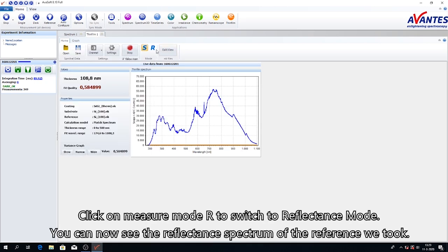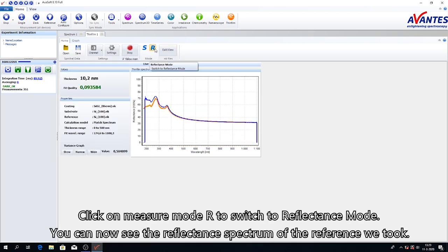Click on Measure Mode R to switch to reflectance mode. You can now see the reflectance spectrum of the reference we took.